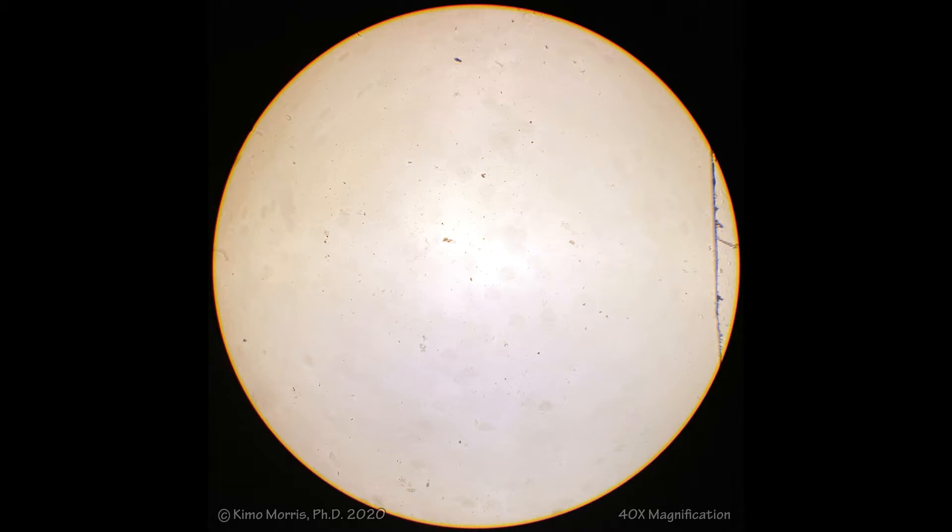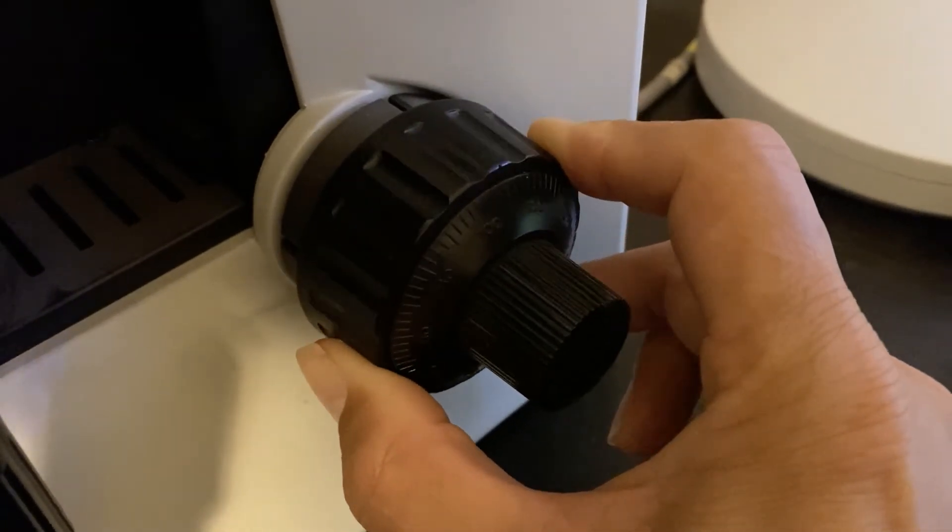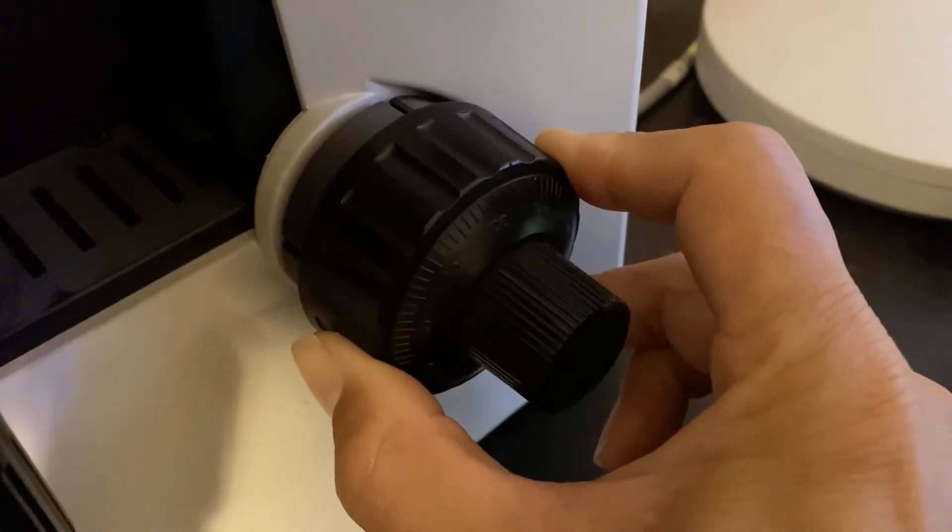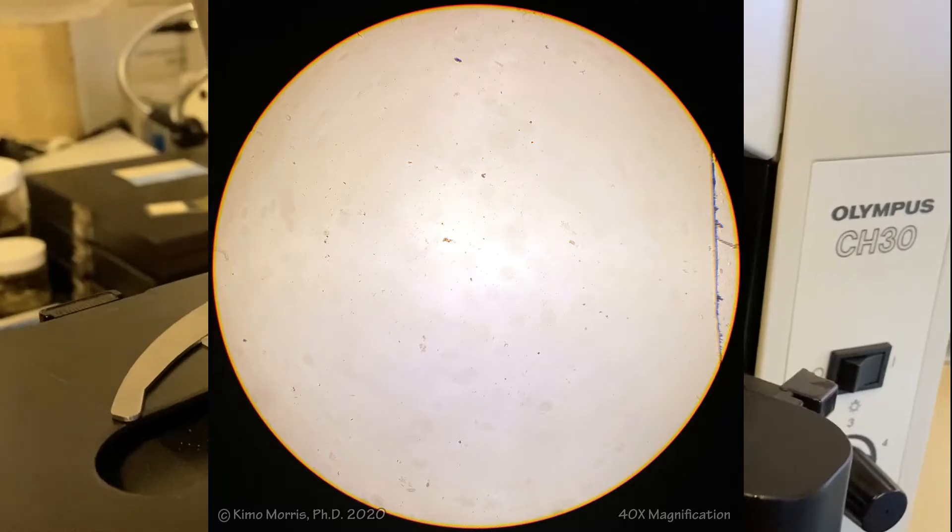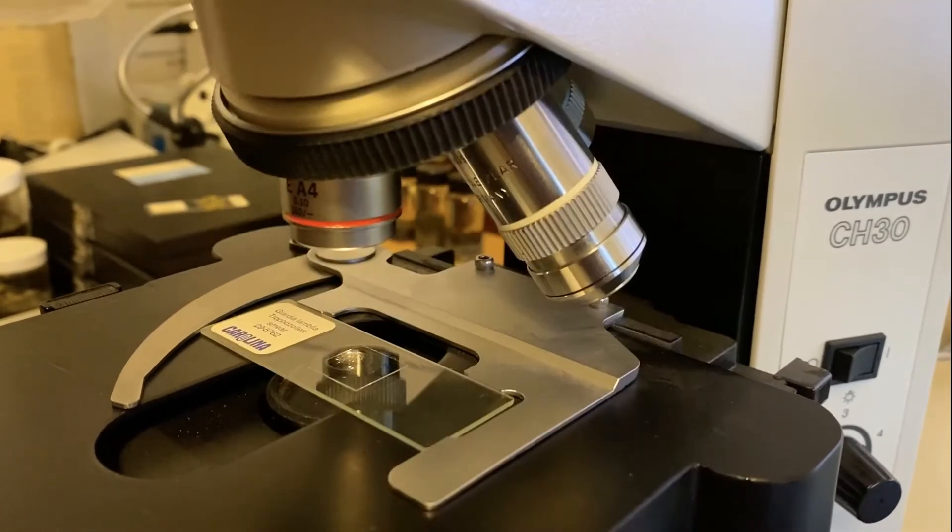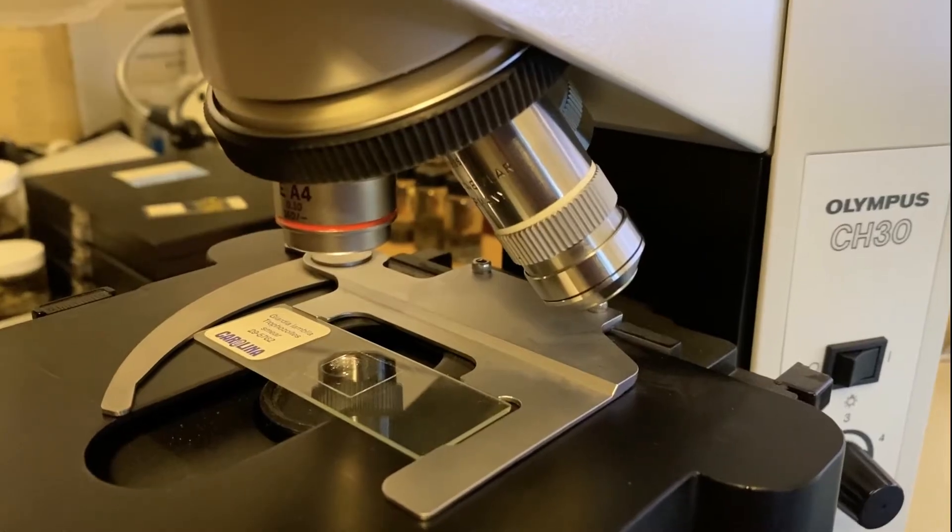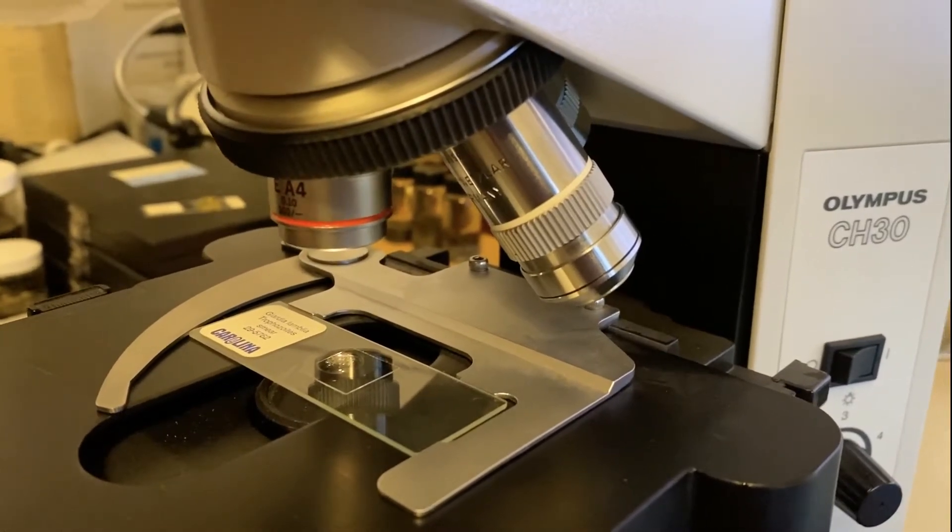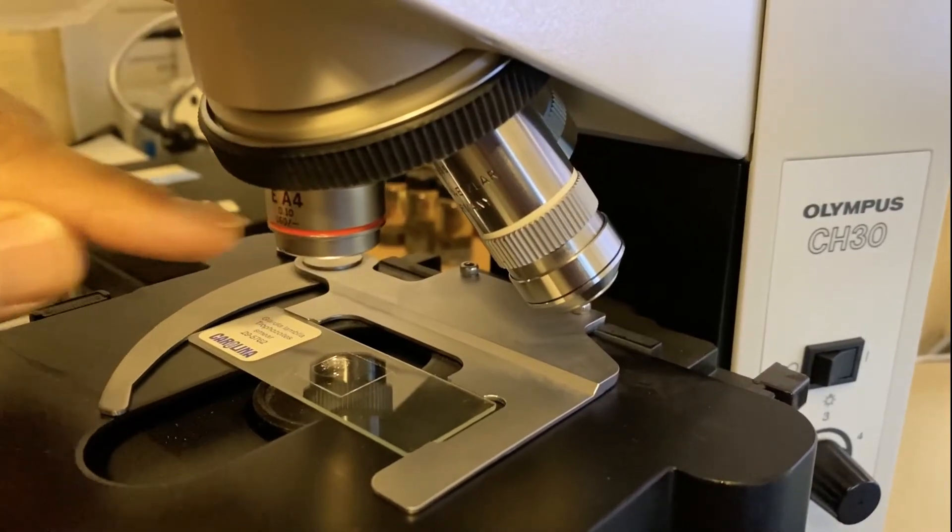However, when you have it set here, you can use your coarse adjustment and make sure that you bring the slide up to the proper plane where you're actually focused on the two-dimensional space that these organisms are found on. Otherwise, if you immediately rush to one of these higher magnifications, the chances that you're actually going to find the proper plane is just really difficult. So I recommend starting out with the scanning power just so that you can focus up to the proper plane.